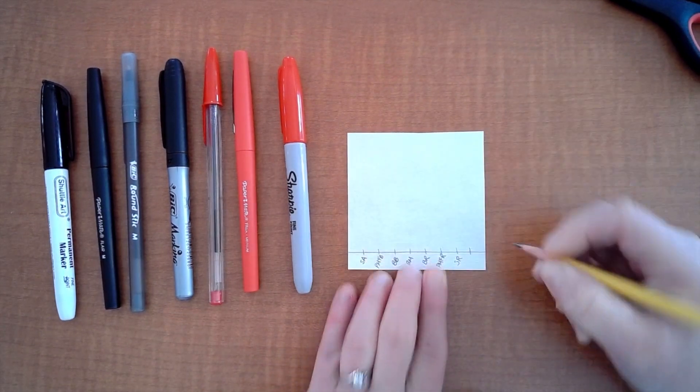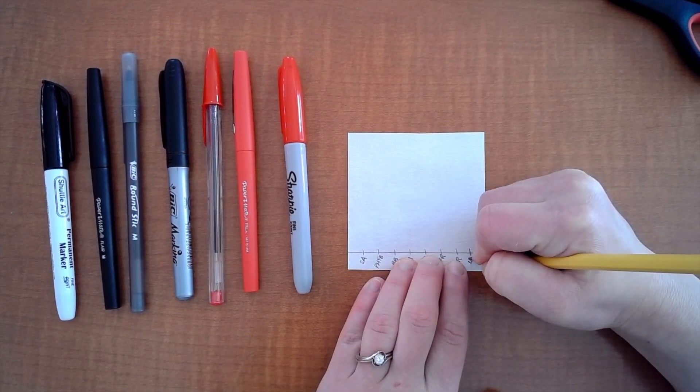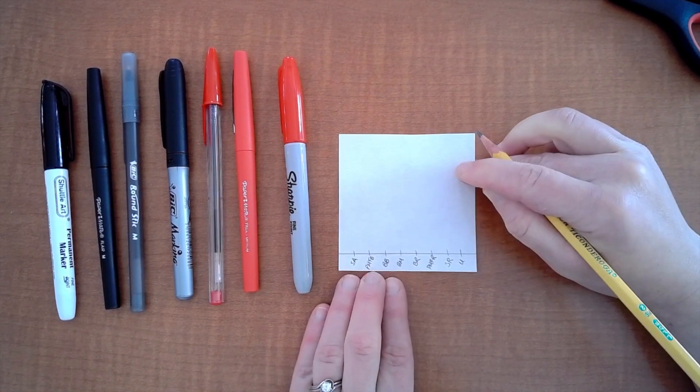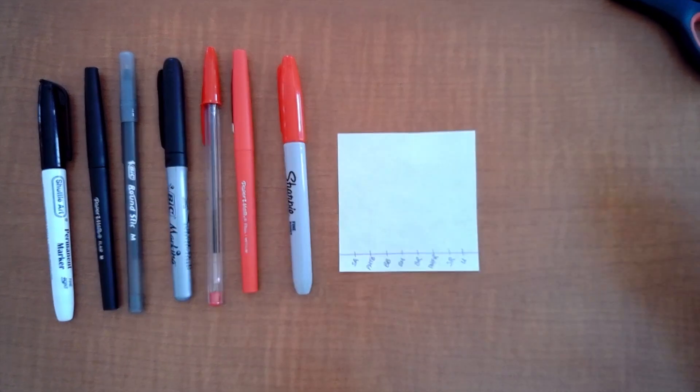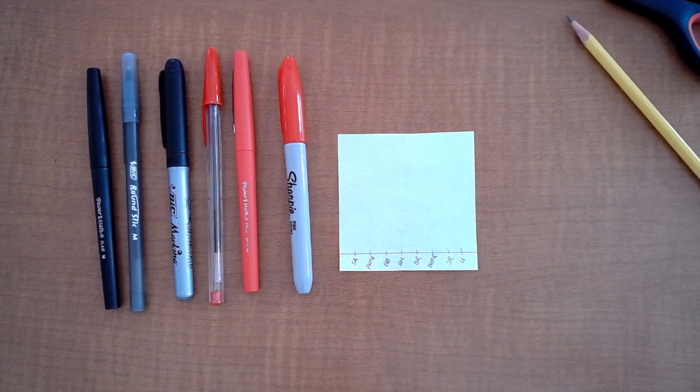And then moving on we have Bic red pen which is BR and then we have Paper Mate Flair red PMFR and then we have the Sharpie red which is SR and then the last one I'm going to put a U there for unknown. So in class if I were doing this I would go to another group for this one. So right now I'm going to mark up all the ones on my sheet.